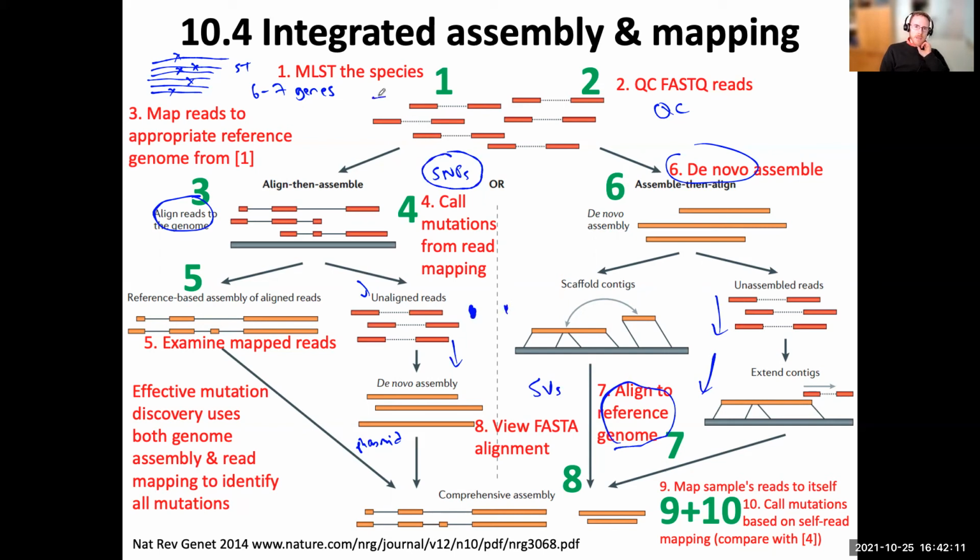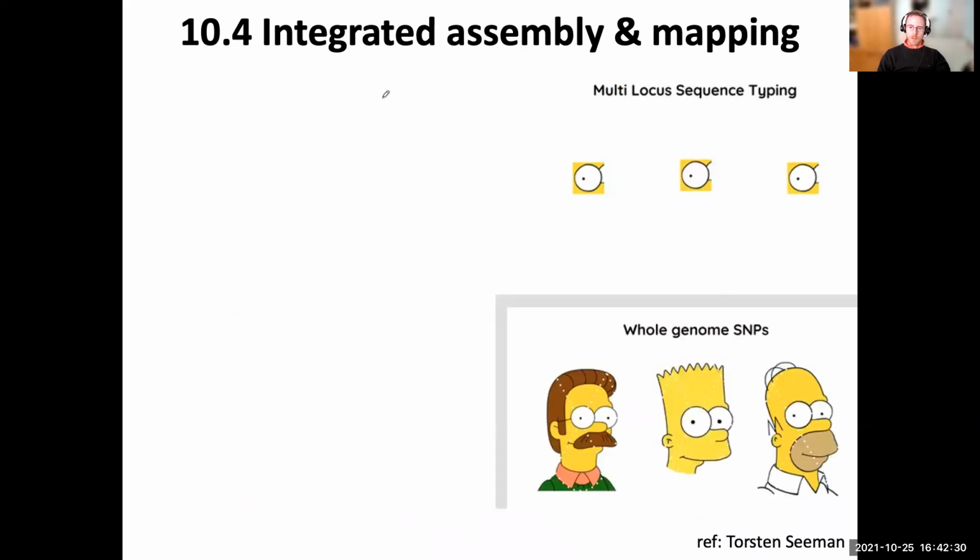Going back to MLST, what that means in practice, for illustration purposes, is that we get an idea of what is present. And that's represented by these three samples here. MLST will identify that they're an eye, probably belonging to a human. But genome-wide sequence data will give us much more detail on what type of human they are.